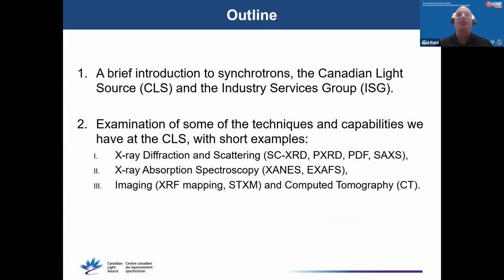So today I'm going to give you a brief introduction to synchrotrons in general, the CLS specifically, and our Industry Services Group. Then I'm going to illustrate a few of our capabilities with some short examples. There will be a variety of examples drawn from numerous different disciplines using both industry projects and some published work as well.